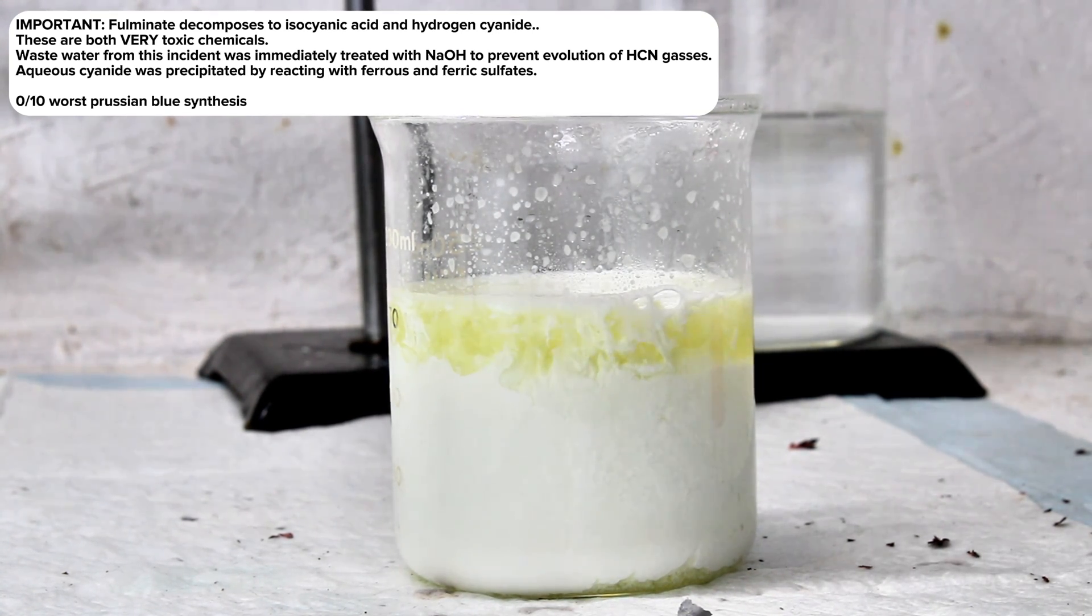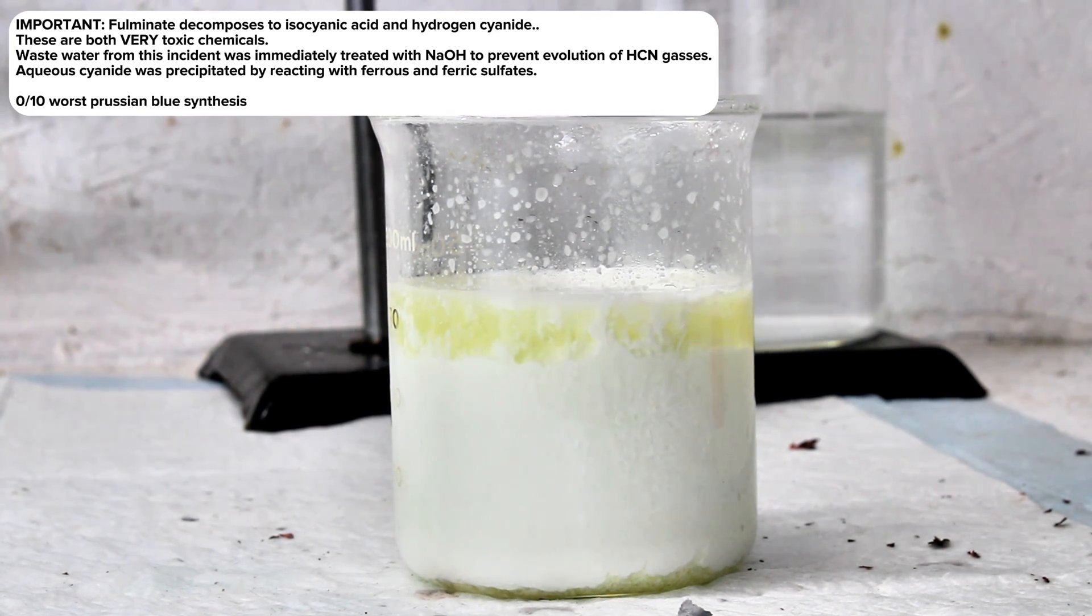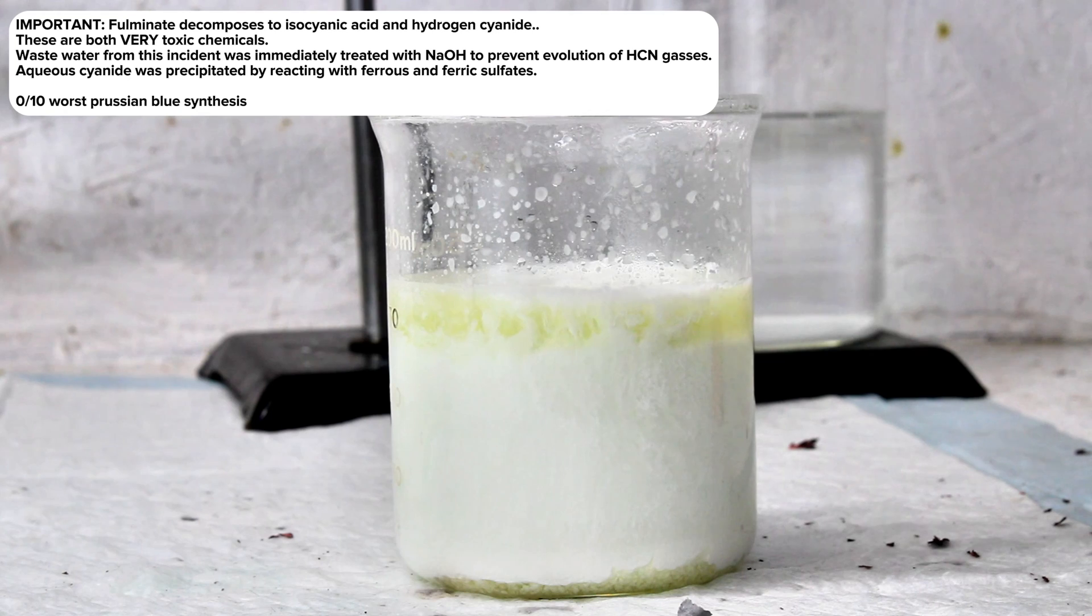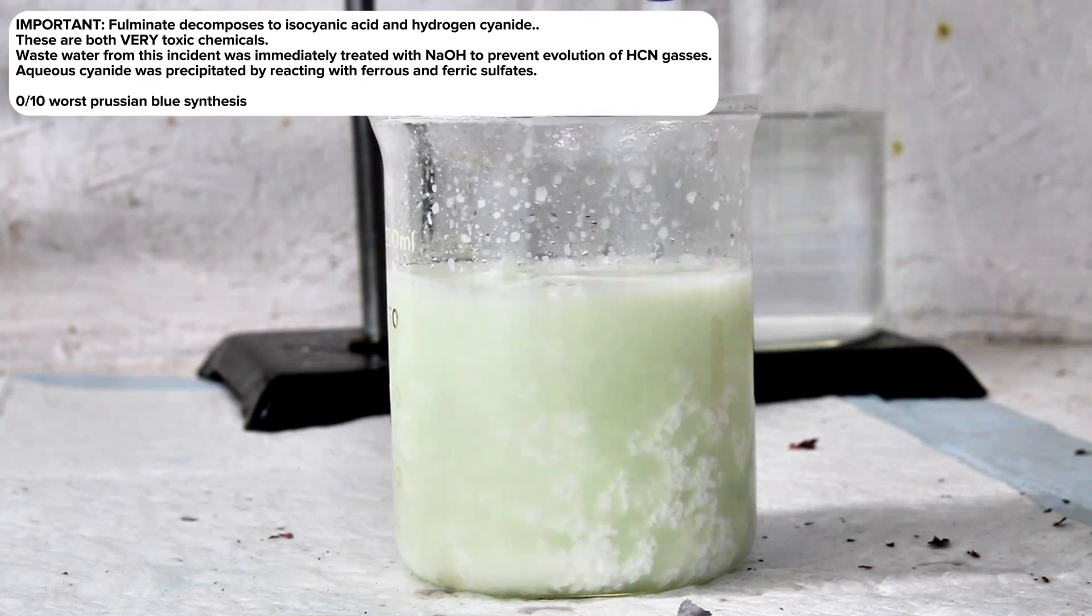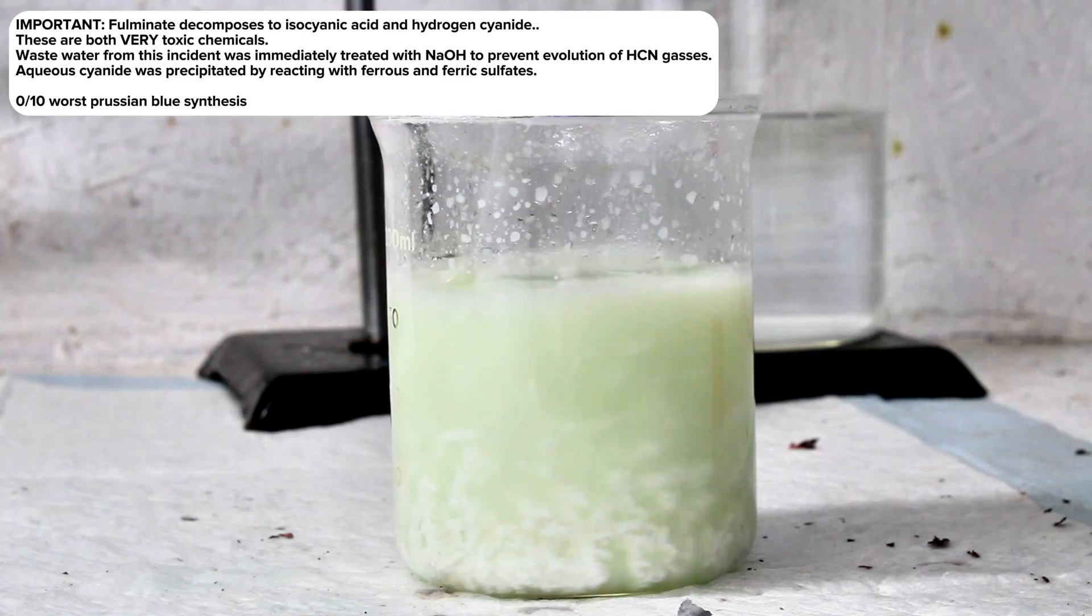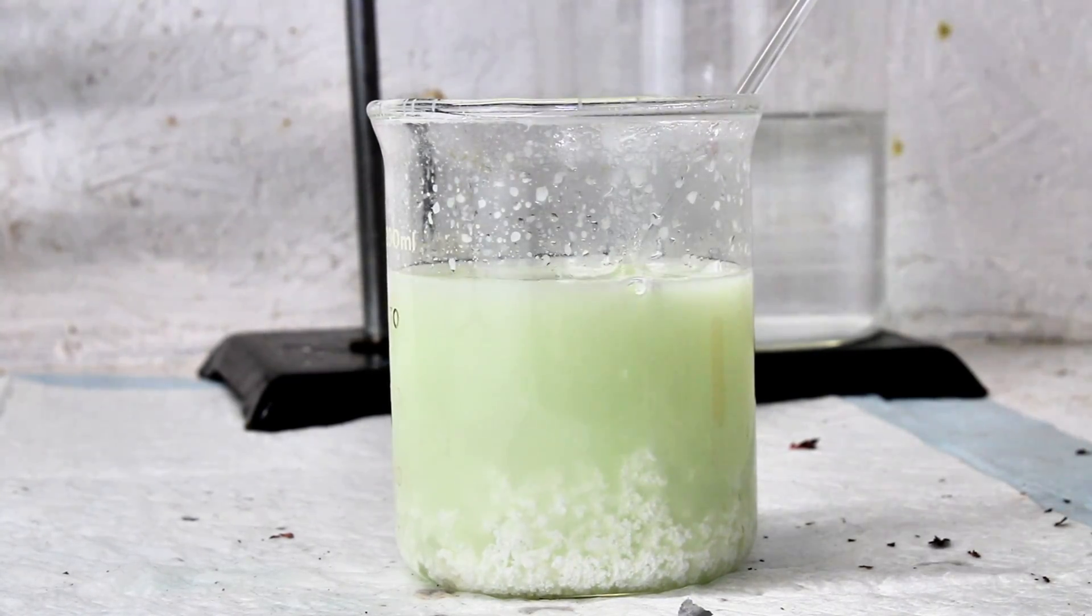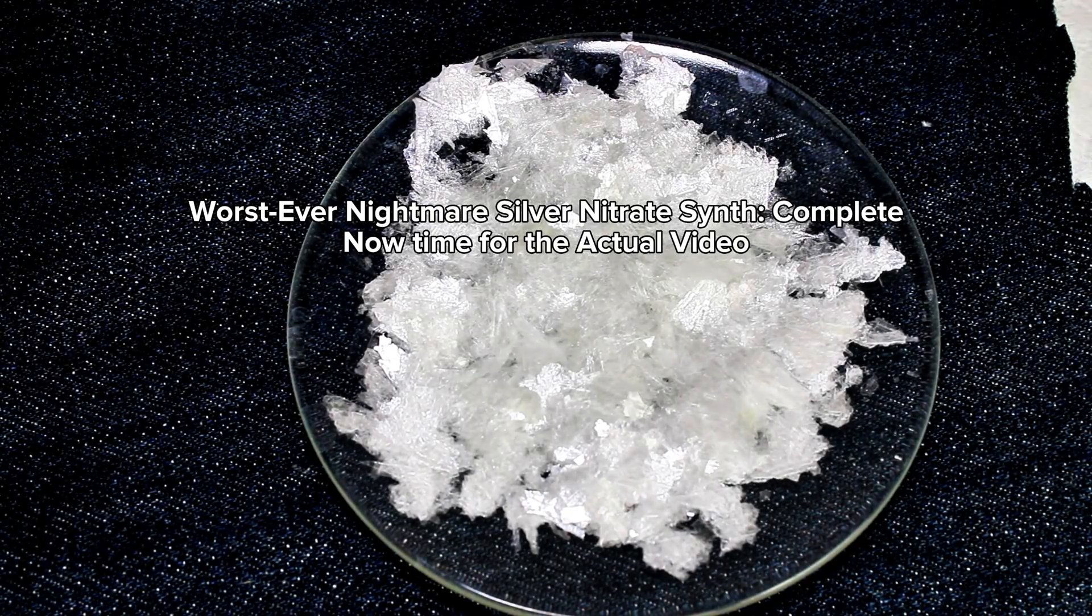So yeah, in case you ever accidentally make silver fulminate and start to panic, just remember you can get rid of it with salt. Also, best to probably just keep alcohols away from silver nitrate altogether. Also, I just realized that a minute ago I think I said that fulminates form in sulfuric acid, so before anyone calls me out in the comments, obviously I meant nitric acid.